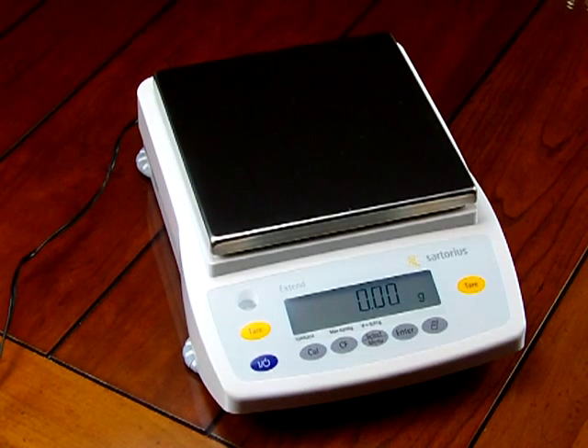We highly recommend this balance. If you have questions or are considering a different balance, give us a call — you really want to compare apples to apples. Sartorius has the experience, the engineering know-how, and builds balances flexible for your weighing application. Visit us at balances.com or scaleman.com. We are Precision Weigh-In Balances, an authorized Sartorius dealer. We keep the GW6202 in stock, so there is no delay on delivery.